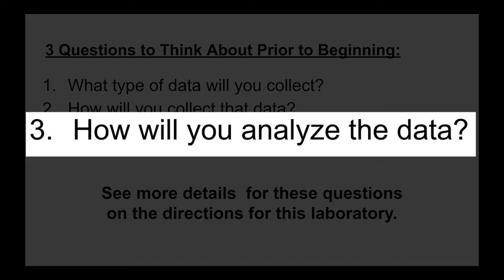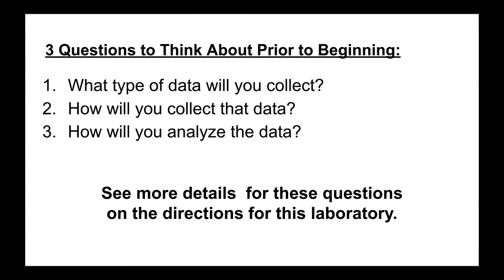And number three, how are you going to analyze the data? What's that going to look like? What's the analysis of that data going to look like? So you and your group need to think about those questions. There are some other additional questions maybe to help frame that up, and you'll find those on the directions for the lab.